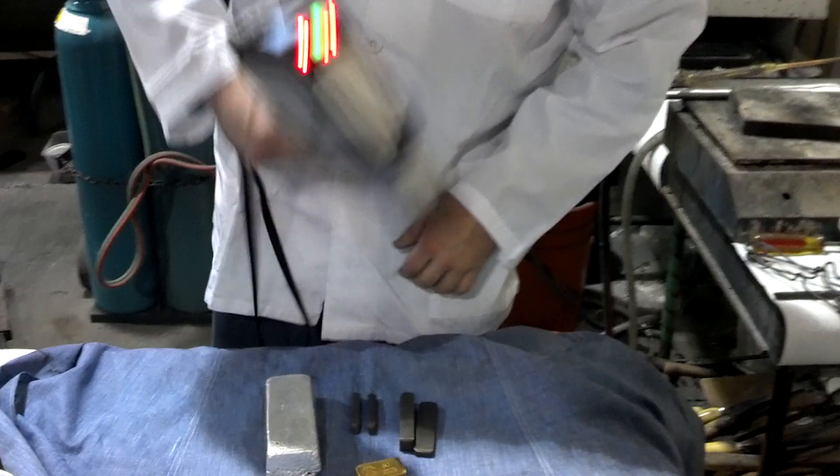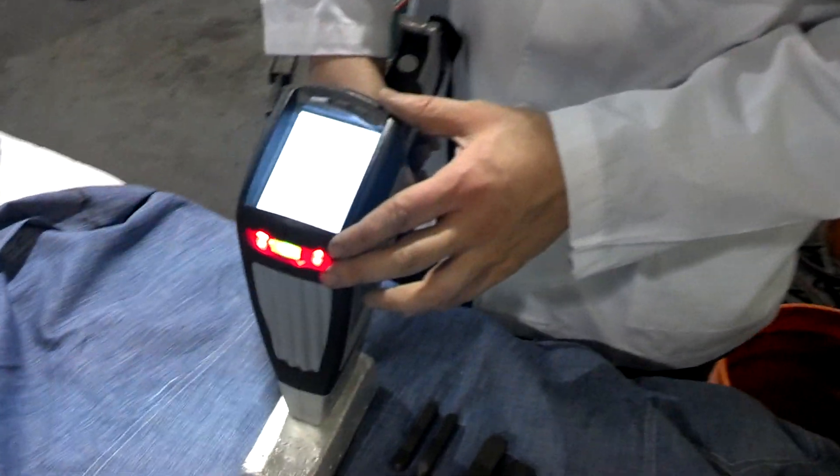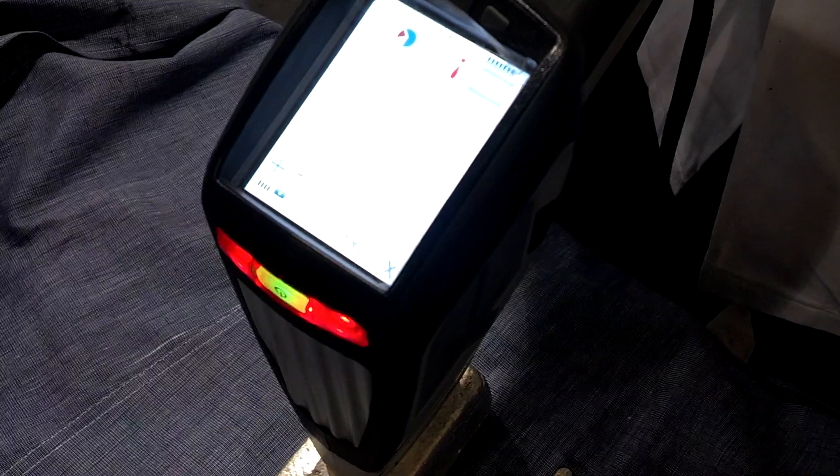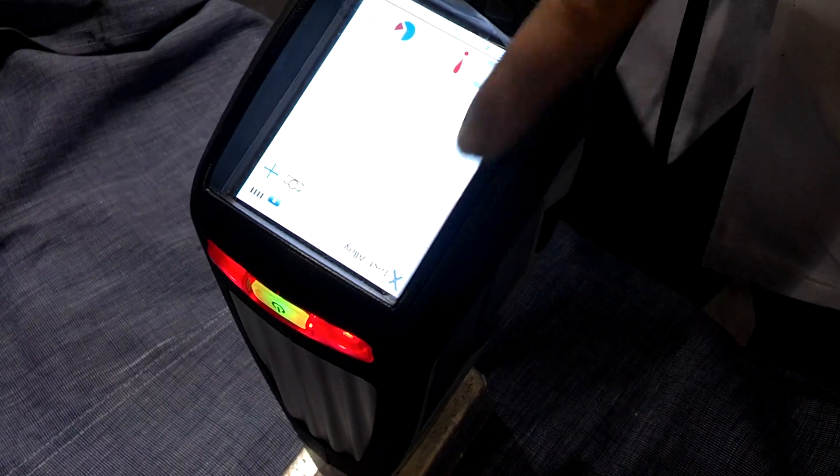This is an x-ray spectrometer. We put that on the metal and we pull the trigger to get an assay. It throws an x-ray onto the silver and as we're coming up, AG, which is the chemical element for silver, it is indeed pure silver exactly.